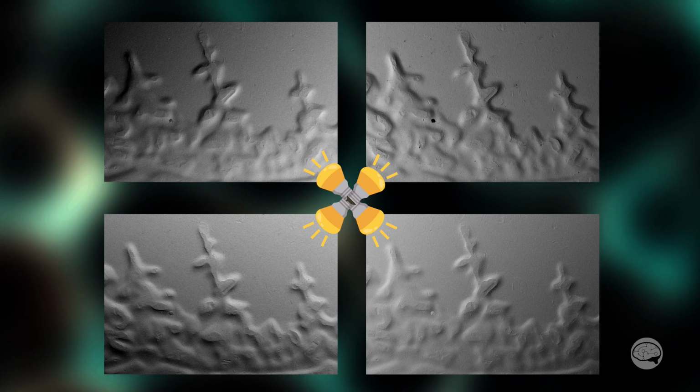Currently, this is my personally preferred method. The shadow method excels where the stereo pairs method struggles. So in flat or featureless areas, we can get perfectly good reconstructions with very fine Z details.